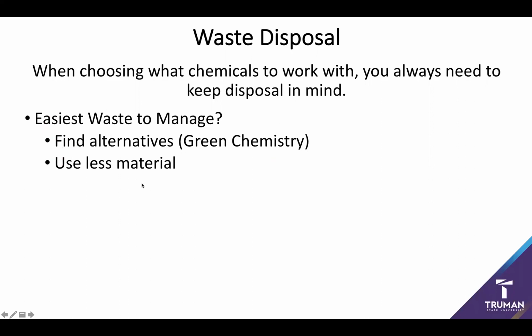In addition, always think about how much material you need. If you only need a gram of product, don't use a synthesis that will produce about 10. Try to make sure that you're using the actual amount of material you need.